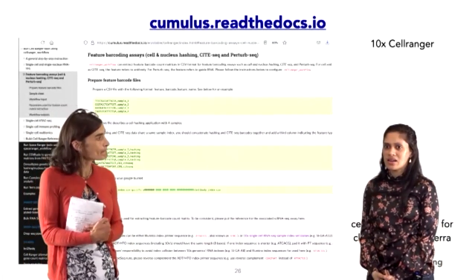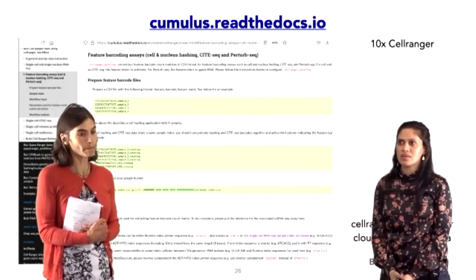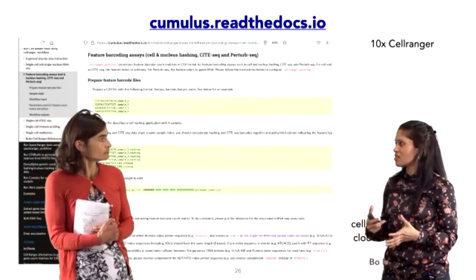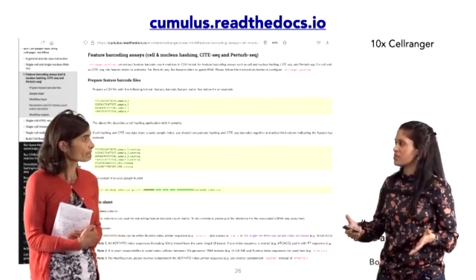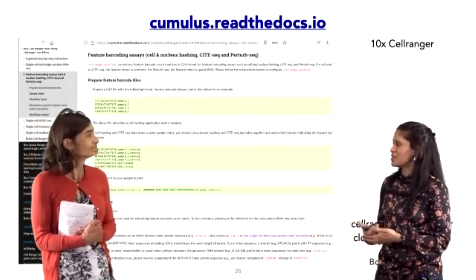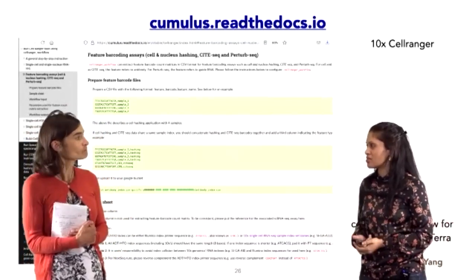Yeah, I think, again, I'm not an expert in that, but I think we could imagine if we had controls not in the environment and observations in the environment, we could have a setup like we've discussed in terms of the analyses to ask what's different in the environment versus not. It would depend what our readout is and if it's transcriptomics or some other systems level phenotype for the different species.